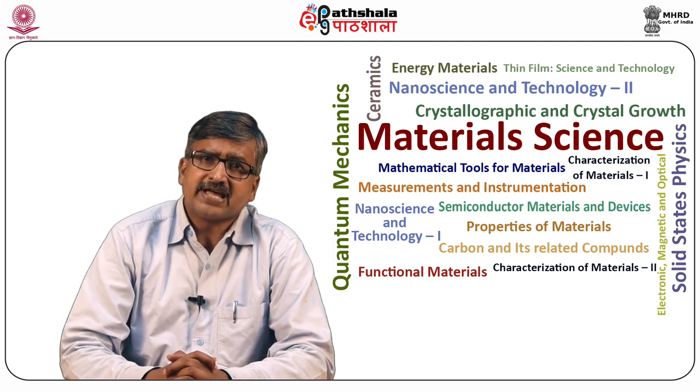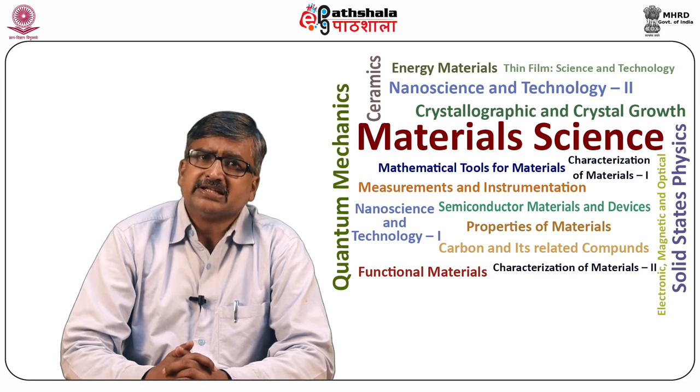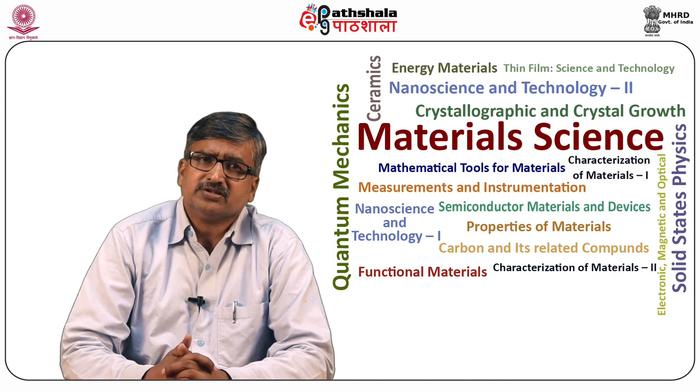Image morphology of samples, for example, viewing sections of material, fine powder suspended on a thin film, or a small whole organism such as a virus and bacteria, can be done using this method in transmission electron microscopy. We can also analyze the composition and some bonding differences through contrast by using spectroscopic techniques, microanalysis, and electron energy loss spectroscopy.